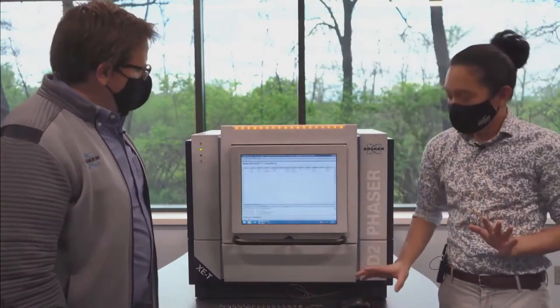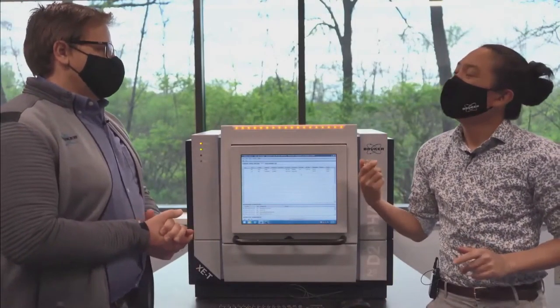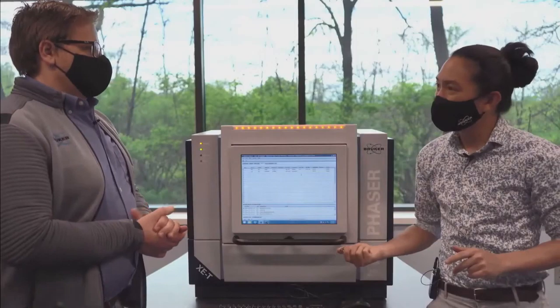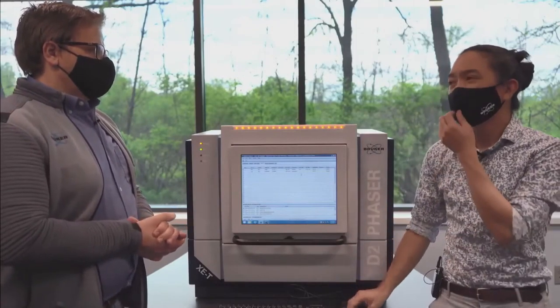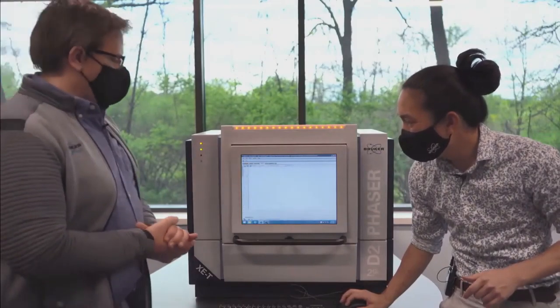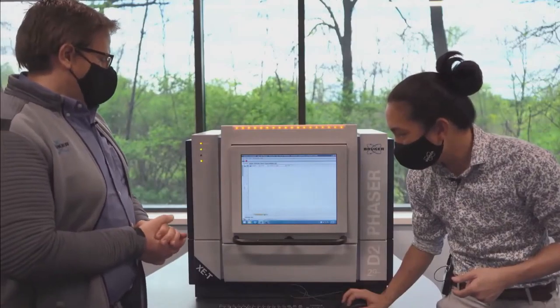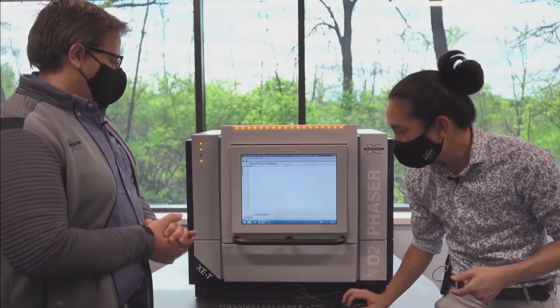All right. Now, this is a real-world sample, right? And often, naturally occurring samples or real-world minerals don't look quite as good as that synthetic corundum. So we're not going to see those sharp peaks, and we might not see quite as good data. And this is normal, right? Anyone who's ever looked at real-world data knows that this is something that could happen.